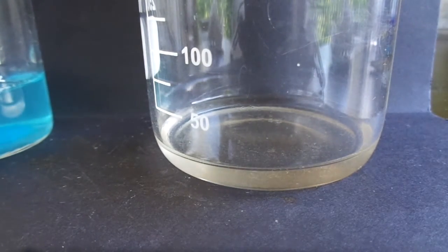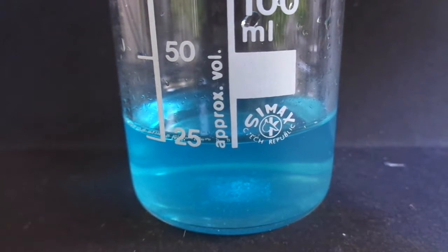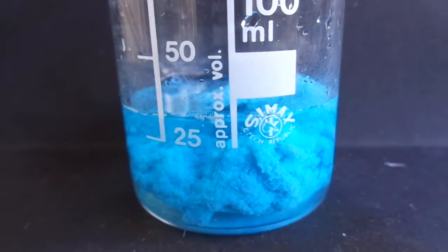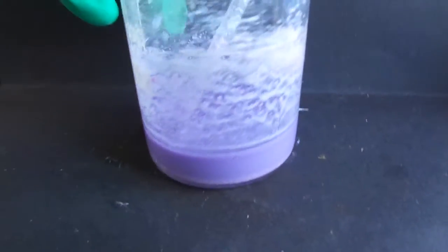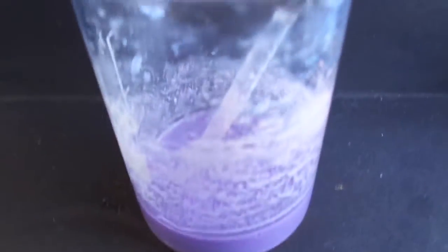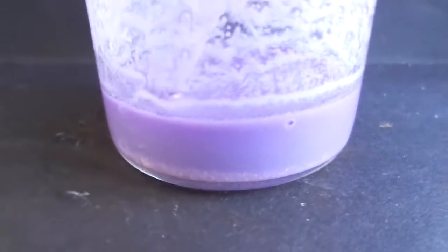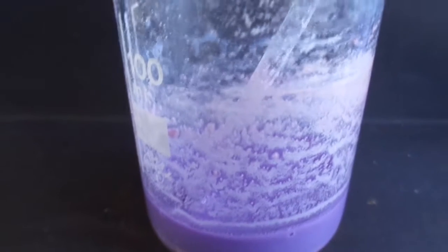I've already packaged some cyanuric acid — I'll label it later. I'm going to make some sodium cyanurate. Let's try adding the sodium cyanurate to the copper sulfate. That's not what I expected — I've only got the copper cyanurate, which is a very nice purple color. I should have measured the exact stoichiometric amounts of sodium hydroxide and cyanuric acid, but I didn't because I was lazy.